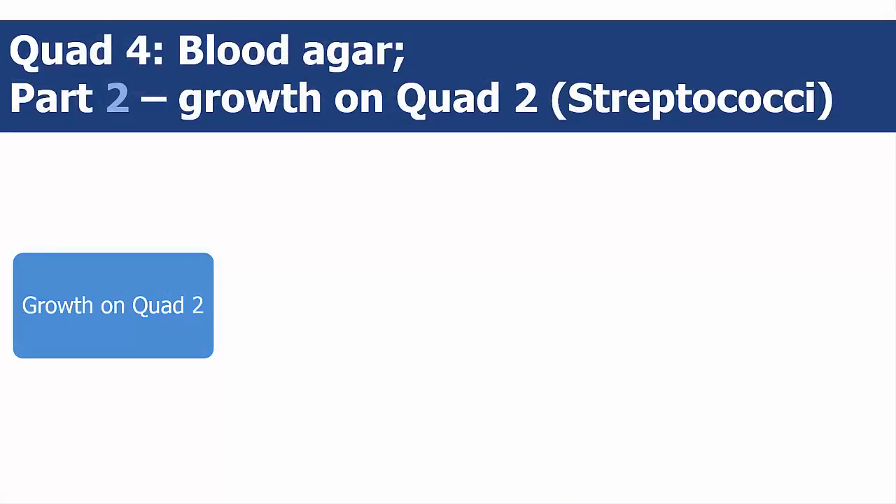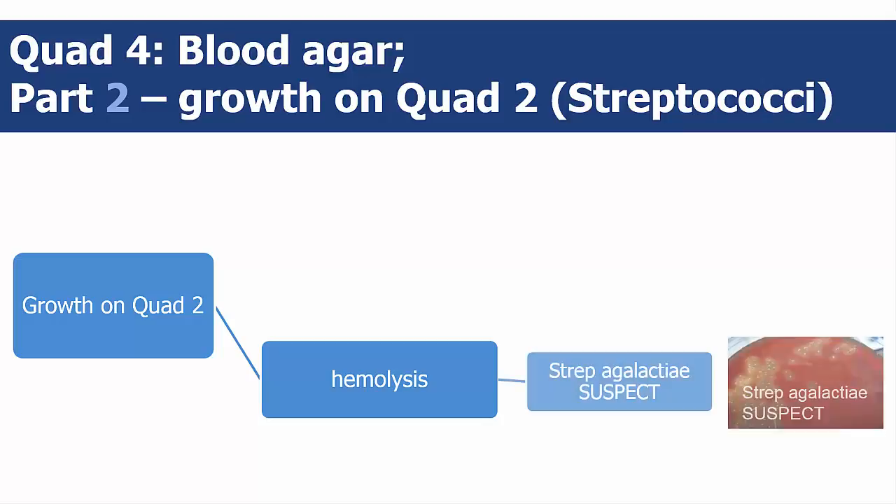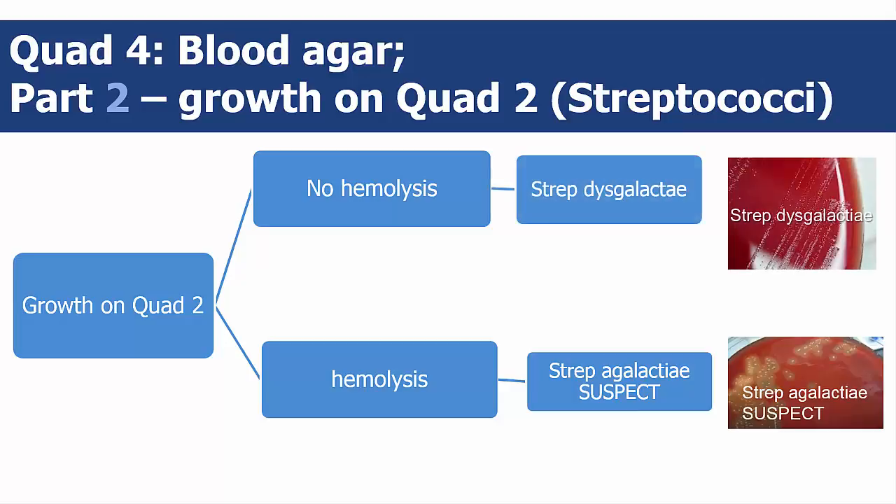If you saw esculin-negative colony growth on streptococci quad 2, you should also see growth on blood quad 4. Hemolysis around small gray off-white colonies indicates strep agalactia suspect. No hemolysis around small gray off-white colonies indicates strep dysgalactia or strep uberis.